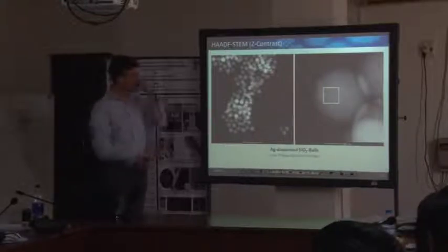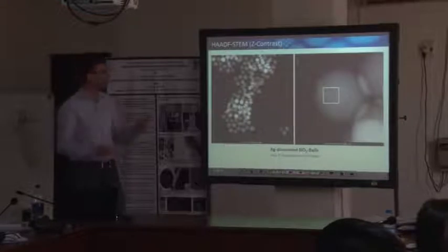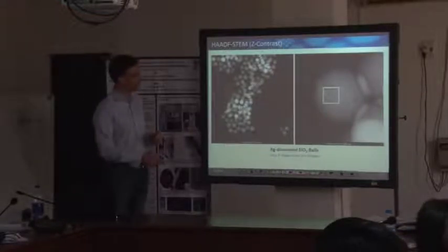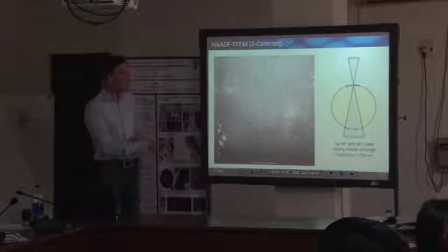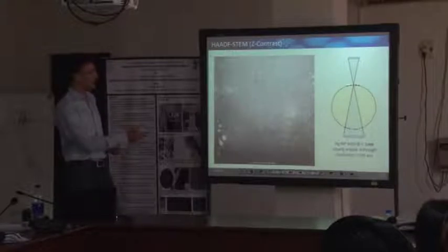But you have to keep in mind, whenever you focus your electron probe, this is already a pretty big structure, and you might either focus it up there or down there. If you focus it to the uppermost particles, you will not see those.